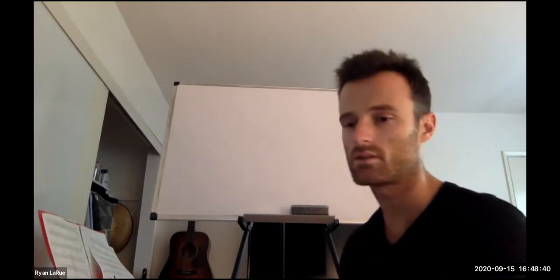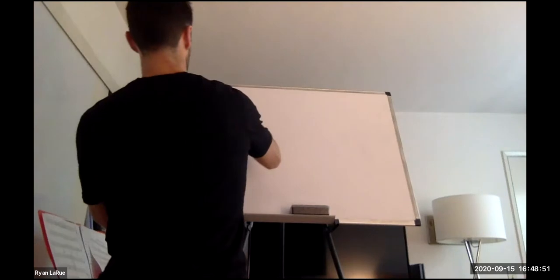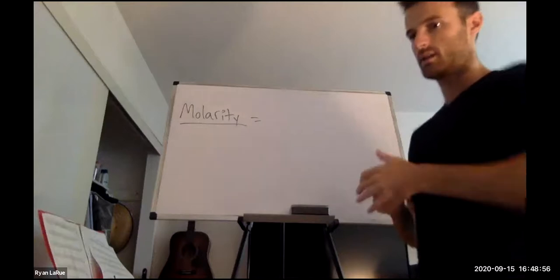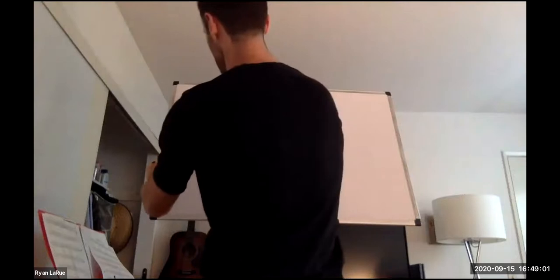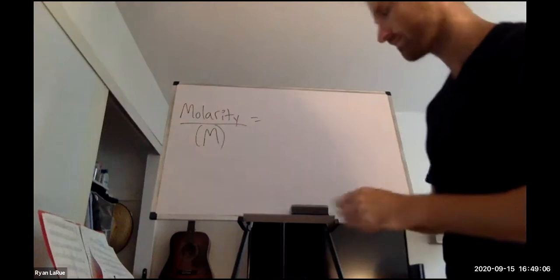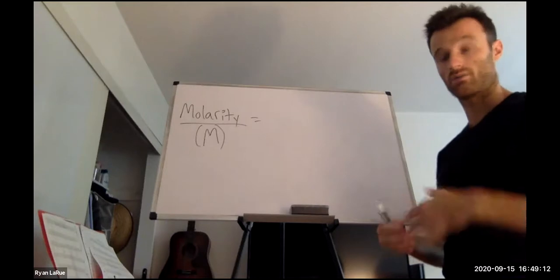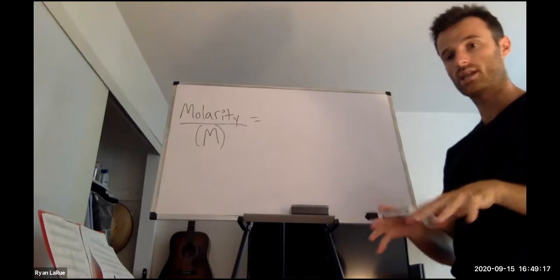All right, first thing I want to just mention is what molarity means. What does molarity mean? So this is in your lab packet in the introduction. Molarity, abbreviated as this big M for molarity. Molarity is a measure of concentration of a solute in a solvent.